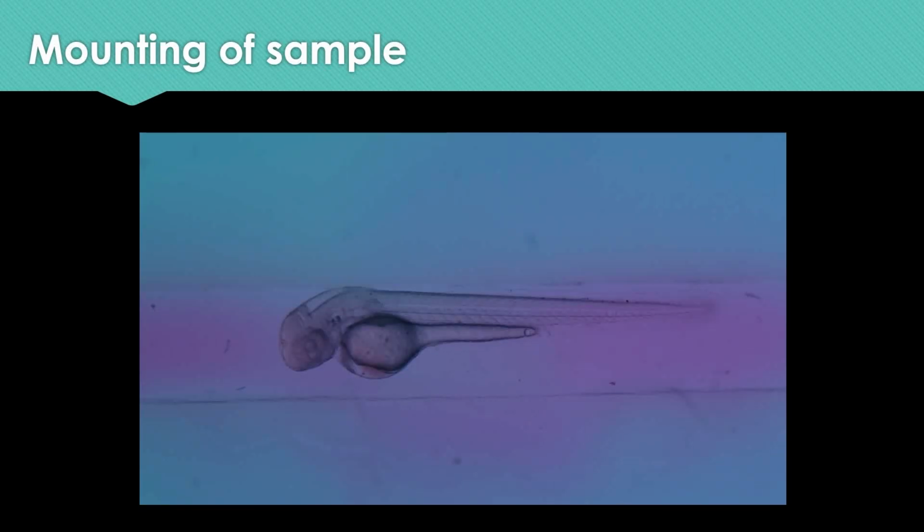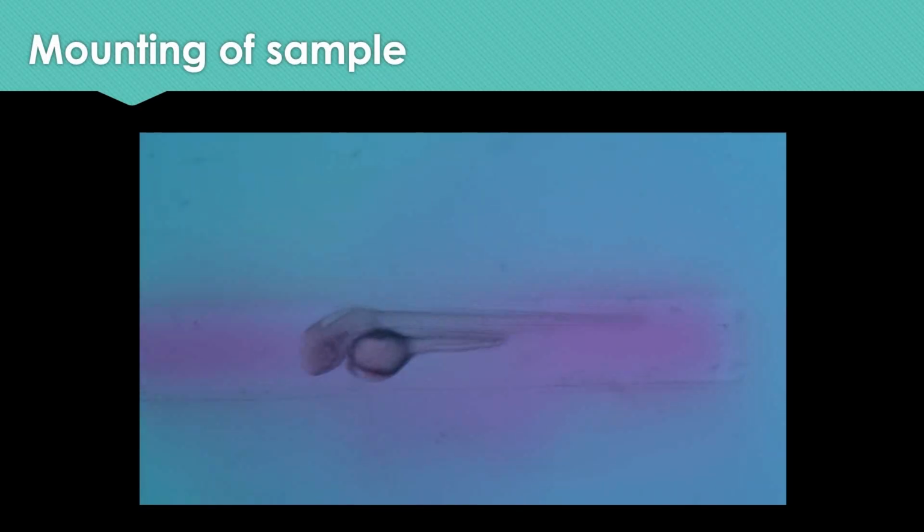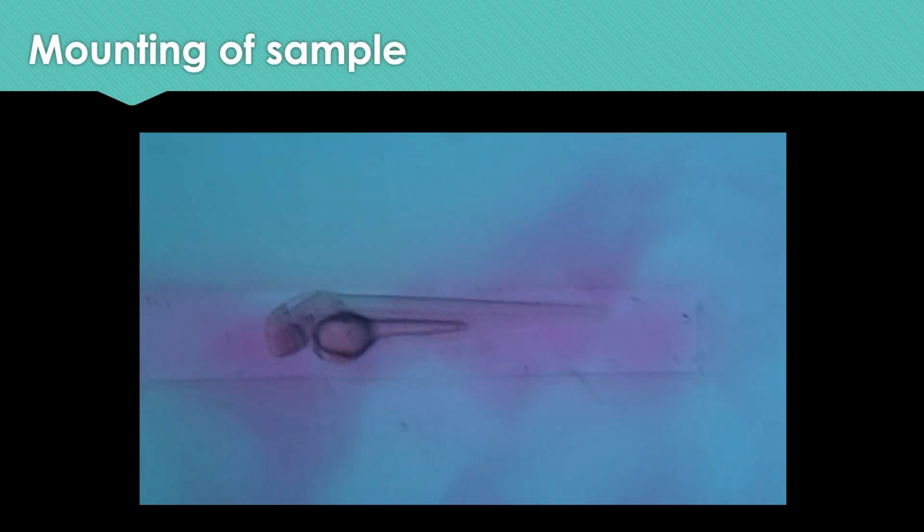The transparency of these agar components, as well as the embryo or the larva being completely transparent with very little pigmentation in normal conditions, or using mutated lines which do not have pigments, allow us to image the embryo within depth. And this lack of pigment also limits artifacts in the sample.